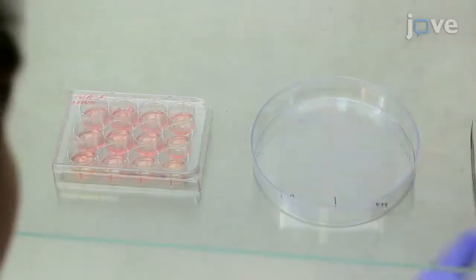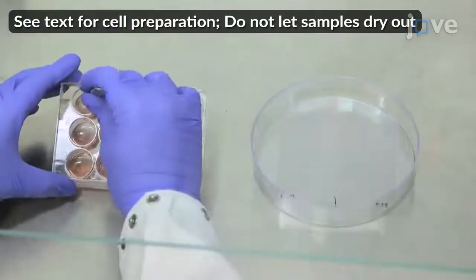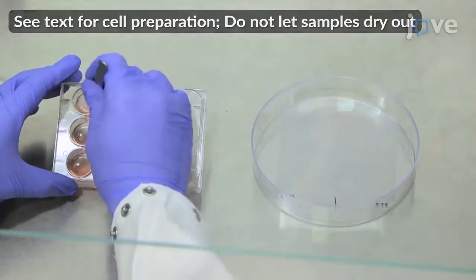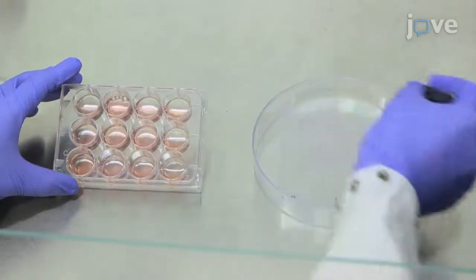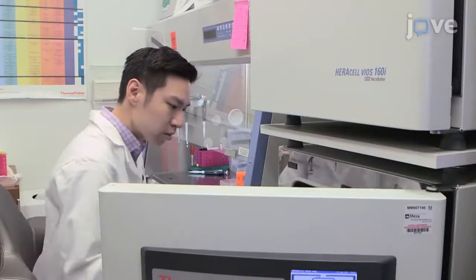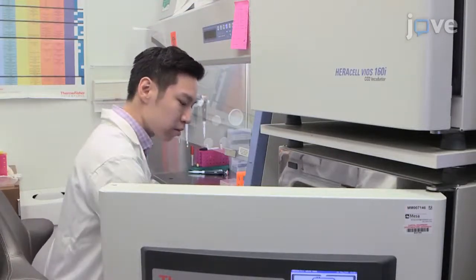To begin this procedure, transfer the coverslips cell side up to a paraffin film-covered tray to save reagents and facilitate manipulation. Save and maintain conditioned media at 37 degrees Celsius for incubation and washing steps.